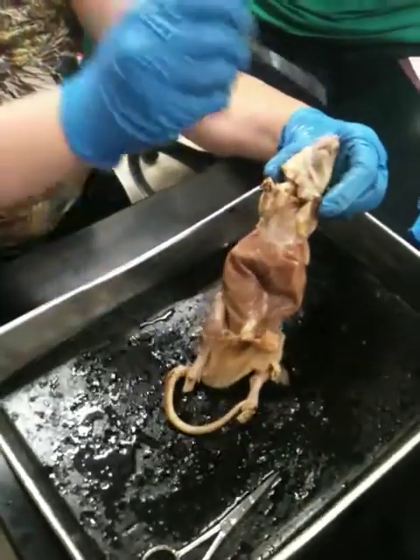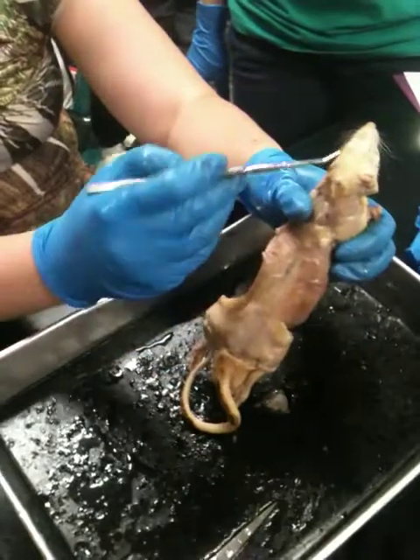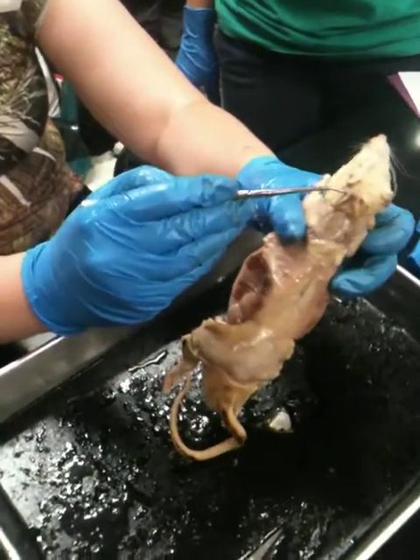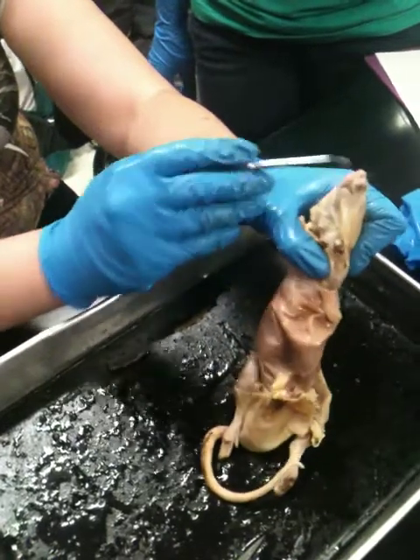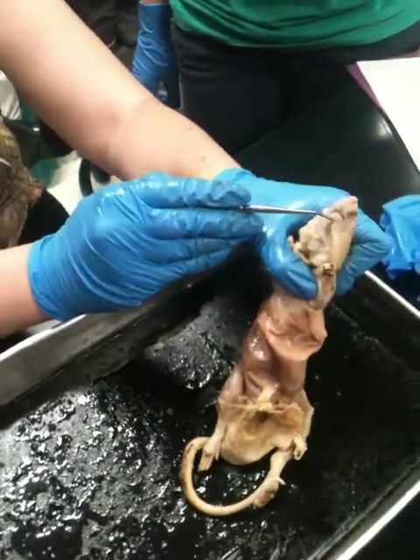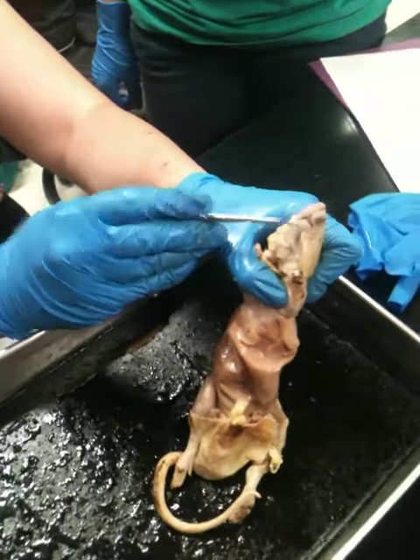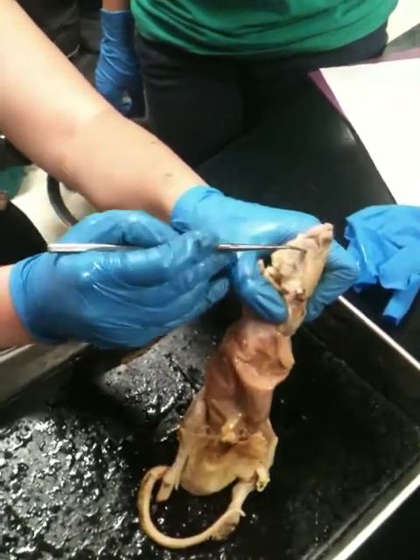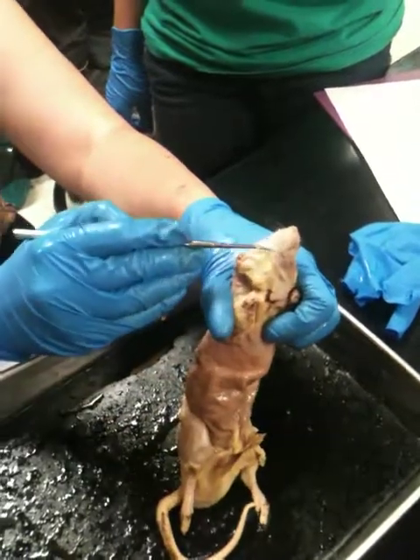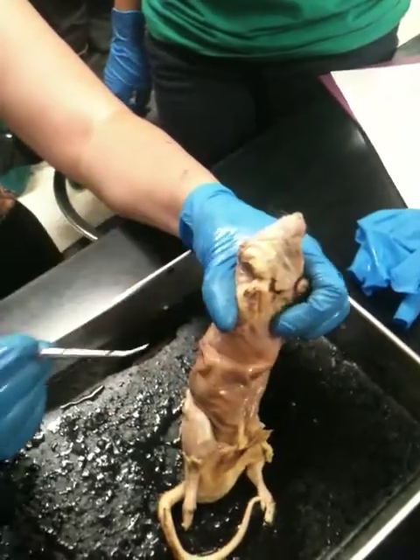So let's go a little bit up. This is going to be frontal, otic, orbital, oral, nasal, mental. Think about mental: you're plotting revenge. That's where you're putting your hands towards your chin. So this is mental. This is going to be buccal, right around here, the cheek area.